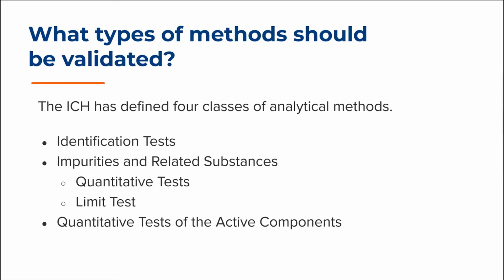The next question is, what types of methods should be validated? The ICH has defined 4 classes of analytical methods.